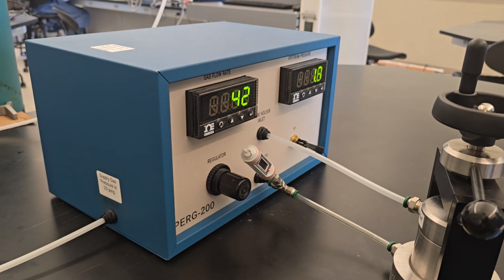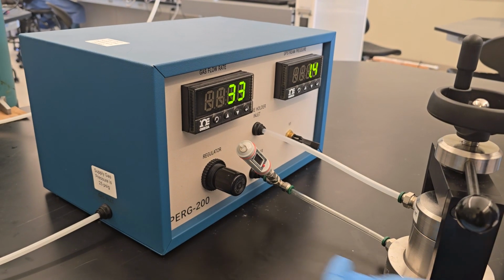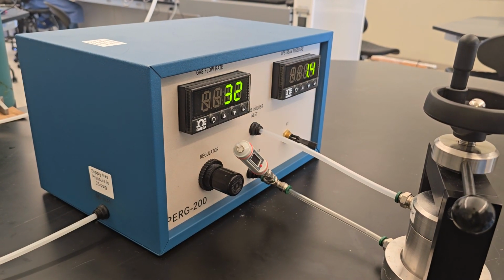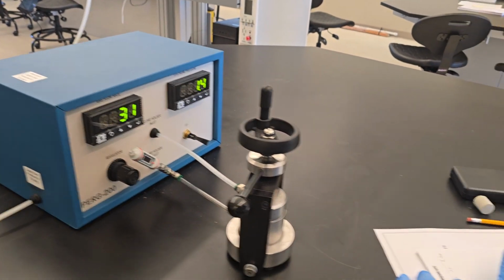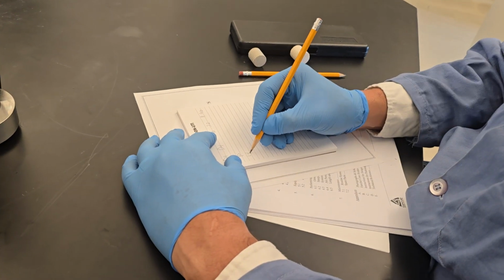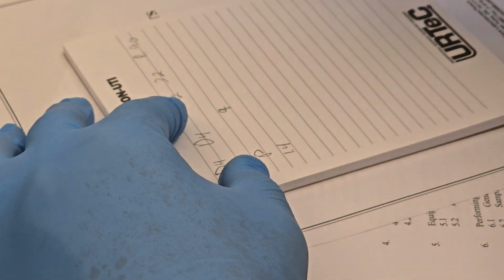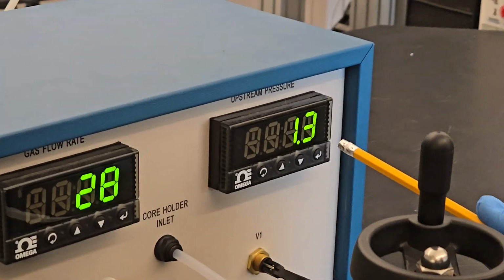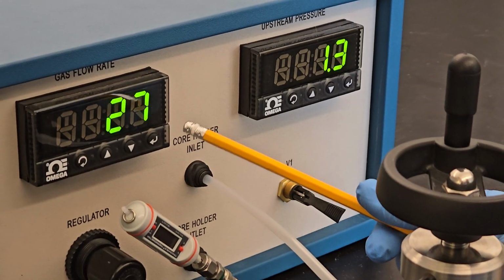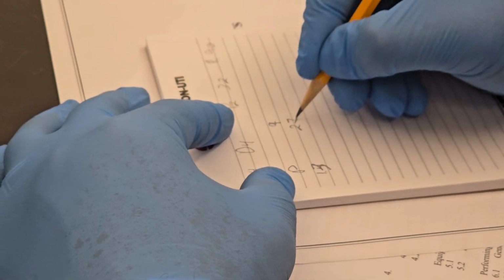You can go from low pressure to high pressure or high pressure to low pressure. So I decided to go with the first one. So 1.4, I'll take that, I'll stop and wait until it stabilizes. So I see it stabilizes here, so the pressure is 1.4. The flow rate is about, okay, it dropped now, it's 1.328. So what I would do is keep my eye at 1.3 and my eye on the flow rate. Once that drops to 1.2, okay, I'll take the last read, so 27. So I got 1.3 pressure and 27 flow rate.